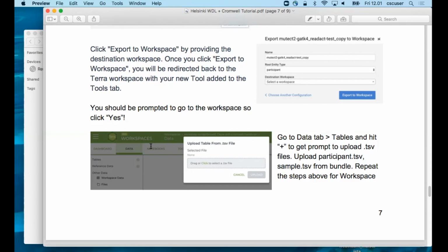And then under workspace data, again, there's upload TSV on the right side corner instead. So there's no plus sign, but on the right side you have this upload TSV. Sorry, left. But wait, on your screens it would be right. Right is fine. Upload TSV, and it says workspace attributes.